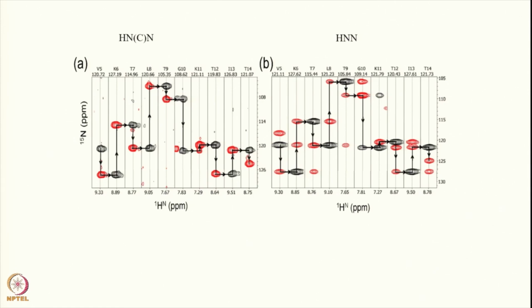So this is therefore extremely useful for obtaining rapid assignments in proteins regardless of the size, especially in intrinsically disordered proteins where there are flexible domains, and it is very difficult to obtain assignments without this sort of dispersion. So N15 dispersion is always good, so you can get resonance assignments in a rapid manner and in an unambiguous manner.